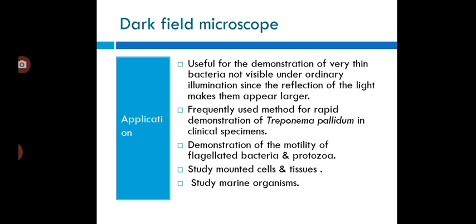Those bacteria or protozoa which have flagella can be observed for motility under this dark field microscope. Next, it can be used to study mounted cells and tissues and also marine organisms.